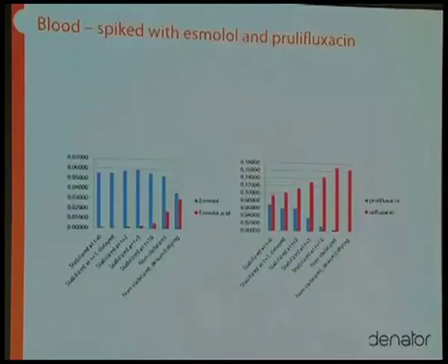If we delay the drying, we put it in a plastic bag for 1 hour before we remove it and let it dry, we see that this sort of conversion continues. So the conversion continues as long as it's wet and as long as there is enzymatic activity. And when we remove the enzymatic activity, we see very low levels of the degradation product.